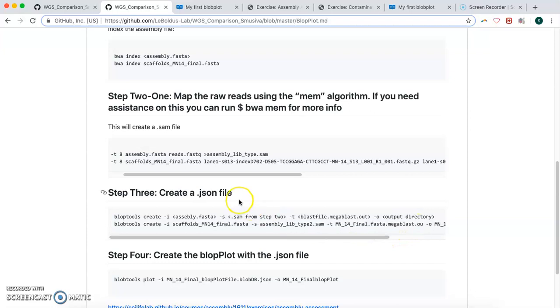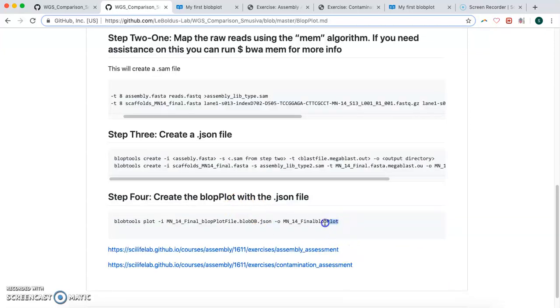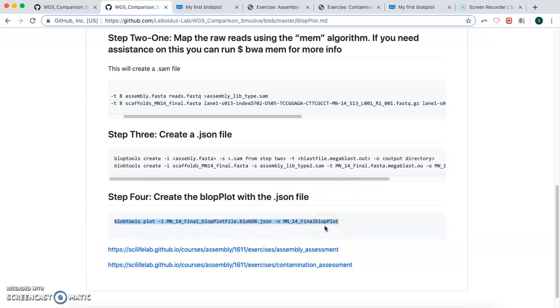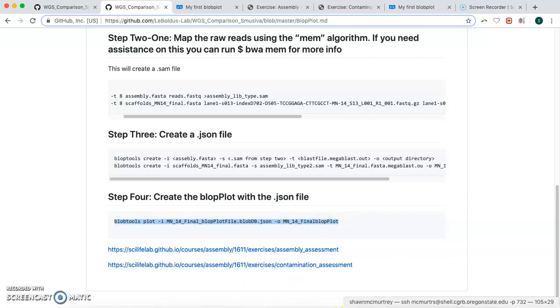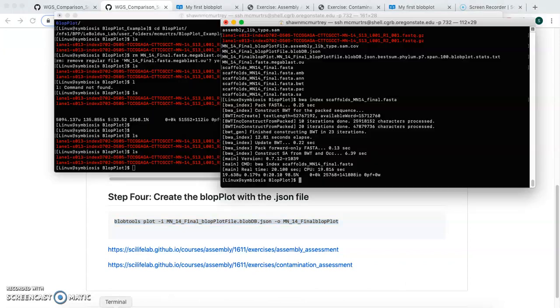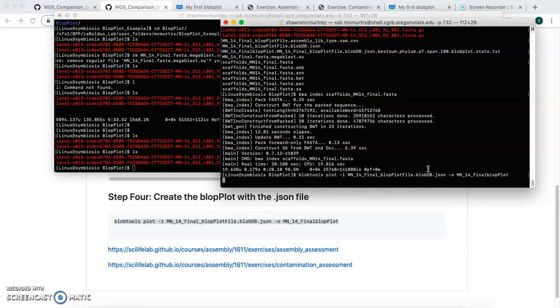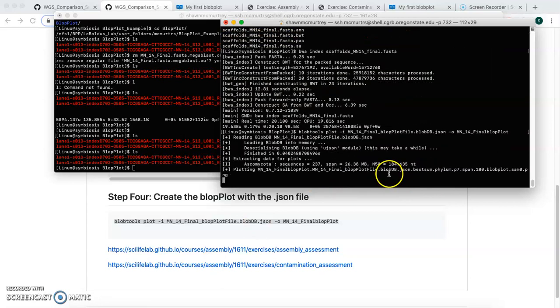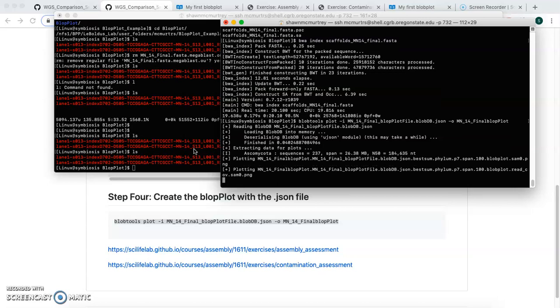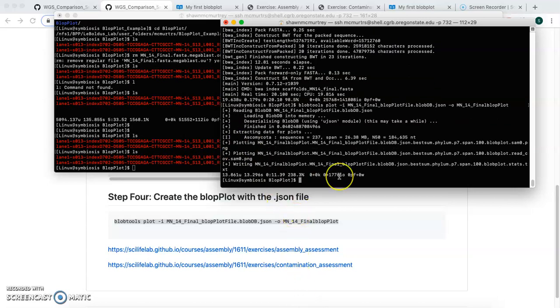So we do that, and then our final step here is to use the .json file and create our final blob plot file, which should create two .png files. And we'll run that one here. It takes maybe, I don't know, 20 seconds or so to do this one. But after that, we should have a .png file.